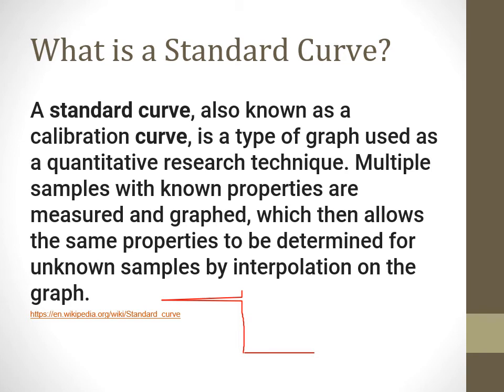So you're going to test known concentrations of beta cyanin. That's what's down here. That's going to be our independent variable. And then light absorbance, I'm just going to put an A here. That's absorbance. That's how much light is absorbed by these things. So you'll have different known concentrations here, and you're going to see how much light they absorb, right?